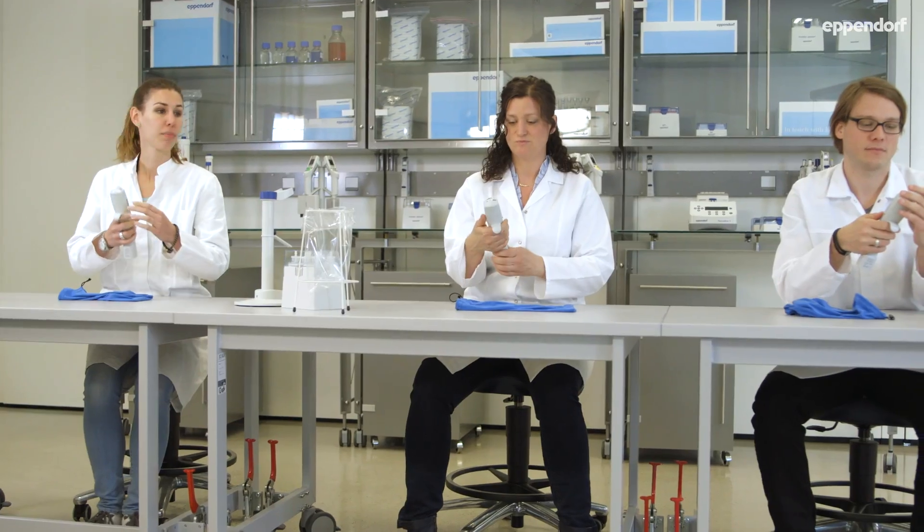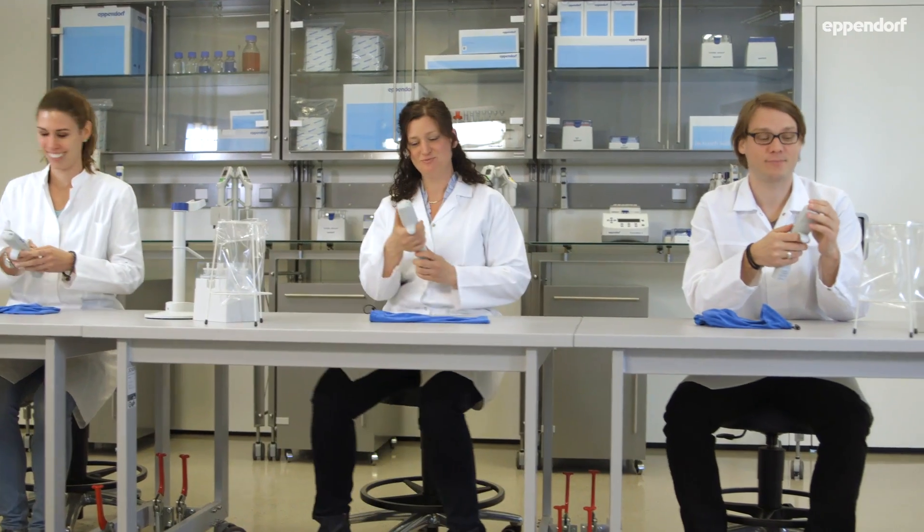Fancy! Very light. Mine's got my name, has yours? This one is mine now, I won't let anyone else have it.